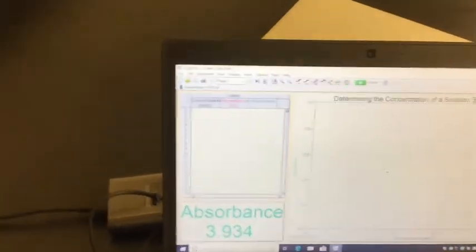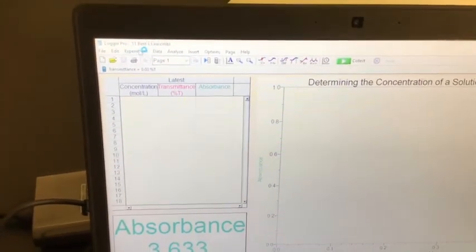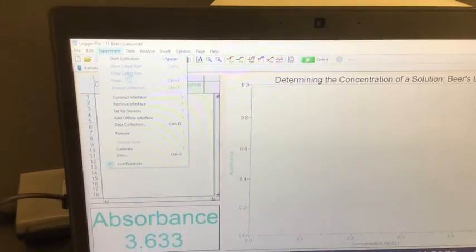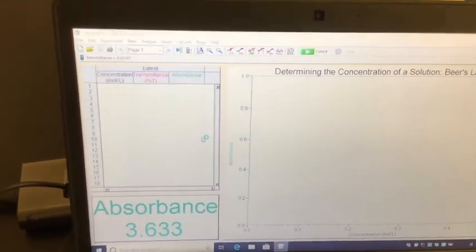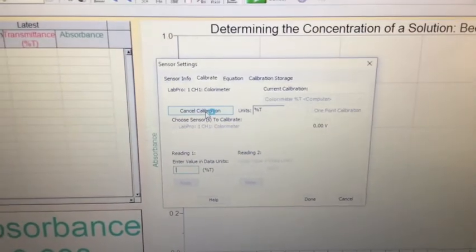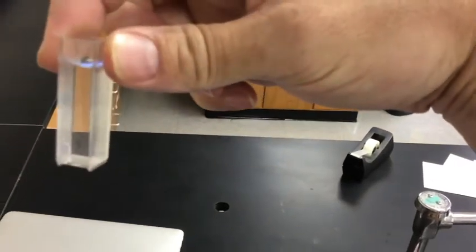Now we're going to calibrate this device. To calibrate, go up to Experiment, then go down to Calibrate, and calibrate the LabPro colorimeter. It will give you a calibration window asking what you want to do — select Calibrate Now. Come over to the colorimeter and open it up. In order to calibrate it, you have to put in a blank cuvette filled with water.